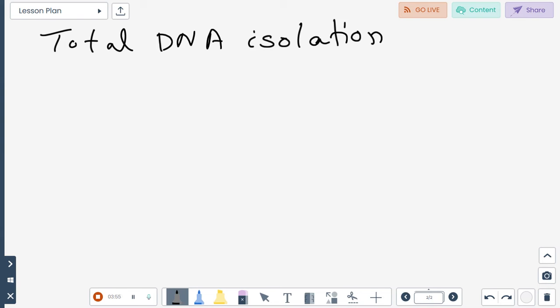When you take a plant, an animal and a bacterial cell, all of these have different cell wall materials, and the plasma membrane composition will also be different. Depending on that you have to use a different lysis buffer. Plant tissues also contain some amount of flavonoids, phenolics and colored pigments, so you have to exchange buffers or do extractions several times to get good quality DNA.